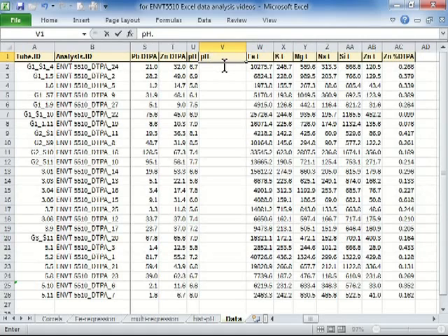Now this becomes a little tricky in Excel, so let's insert a column, pH class, we're going to call it, and we'll use an if statement. If that number is less than 7, we'll say that it's low pH. Don't forget the double quotes.